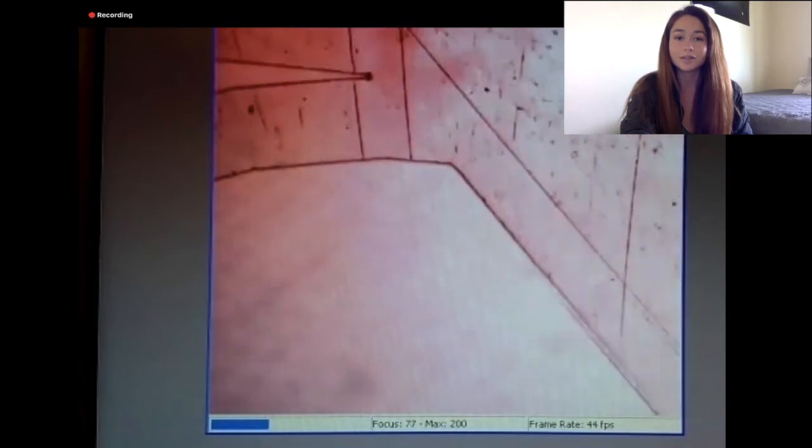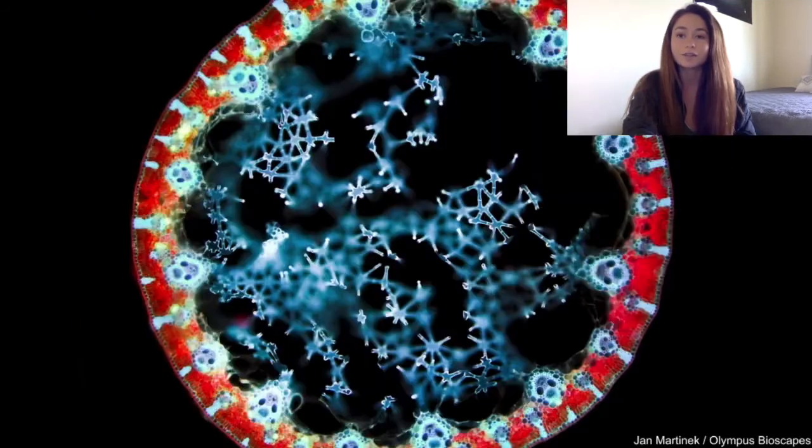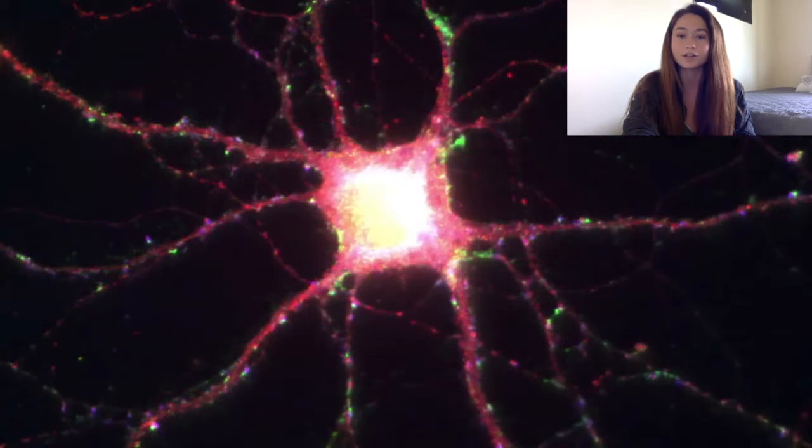The microscope is operable in 2 modes, bright field and fluorescence. Standard bright field illumination is used to locate the sample and focus on the desired sample features, and fluorescence mode is used to acquire more detailed information about specific features of the sample by tagging these features with a fluorescent dye. For example, a microscope user can utilize fluorescence to track fluid particles through a small microfluidic channel or to label a fluorescent protein in a cell.